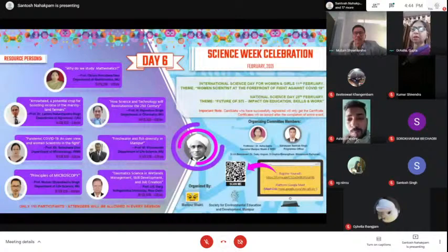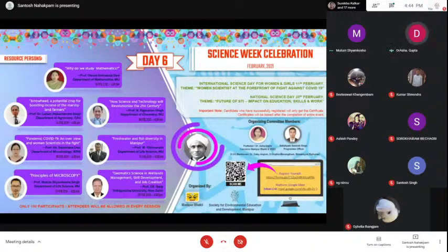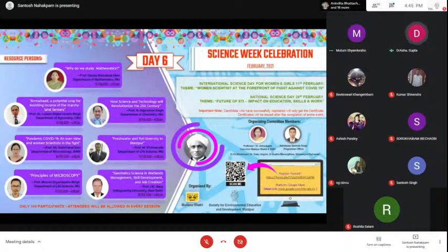You have talked about atomic force microscopy and scanning tunneling microscopy. You talked about the classification of microscopes and started with the source of illumination, that our eye, for example, sees 380 to 750 nm, which is the visible light spectrum. This is used by light microscopy, and the electron microscope uses the electron beam as a source of illumination. You talked about the working principles of the bright field microscope, dark field microscope, fluorescent microscope, and electron microscope.